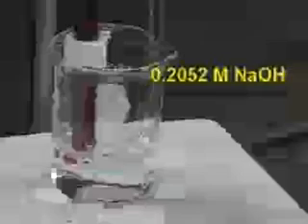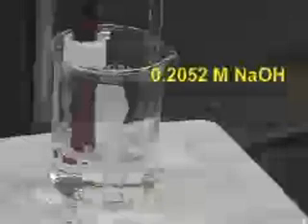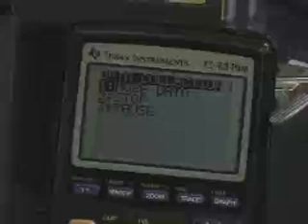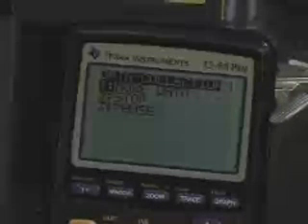Our first point will be before we've added any sodium hydroxide to the solution, so our burette is set at 0.00 milliliters. When the CBL reading is stable, we're going to press trigger on the CBL and enter a value on the calculator of 0.00 milliliters. We want to collect more data, so we'll select more data.